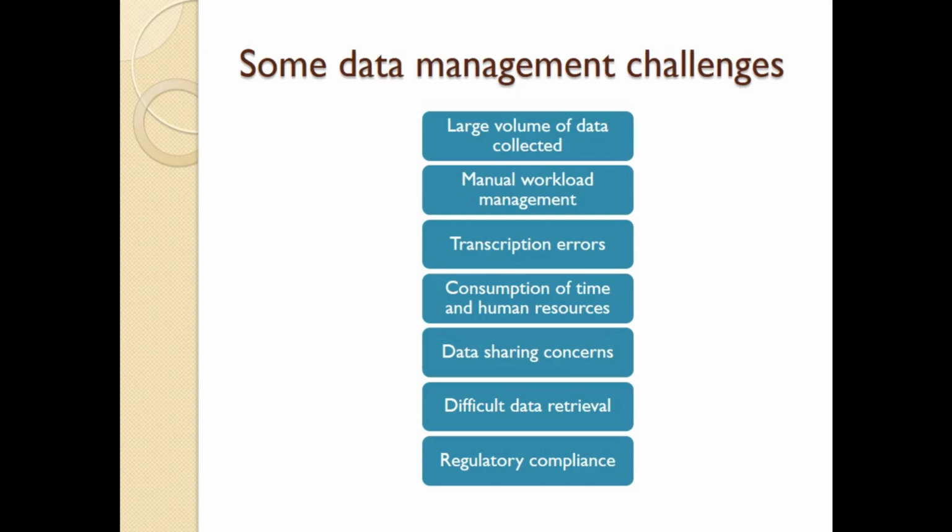Again, that's all transcribed, which costs time and money for the laboratory. So the consumption of time and human resources just echoes that comment. We also have some data sharing concerns. How do we securely share the data once the information is obtained from the laboratory? How do we ensure that data is secure and remains untampered, if you like, if it's shared through, for example, Excel spreadsheets that are non-validated?